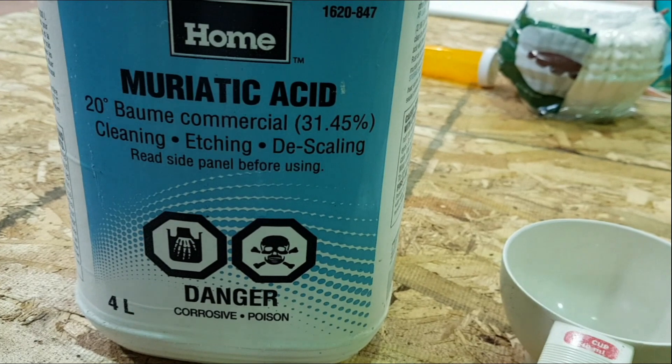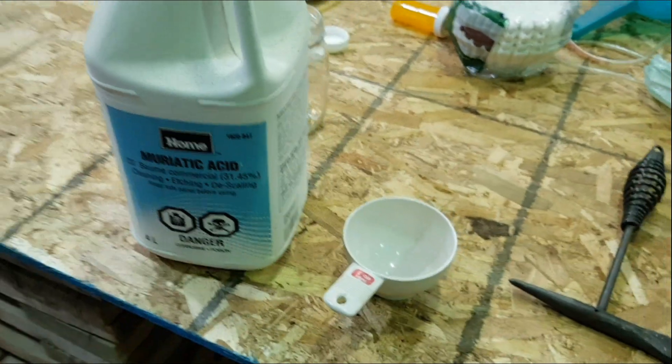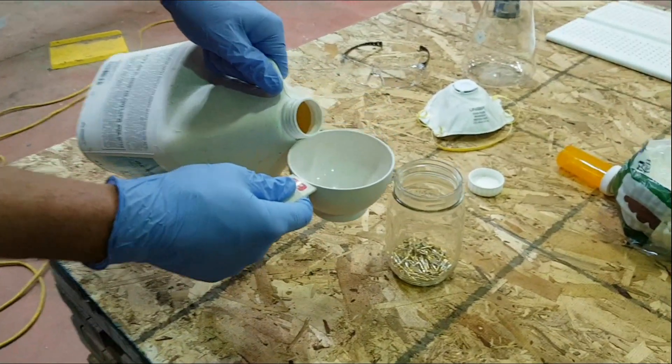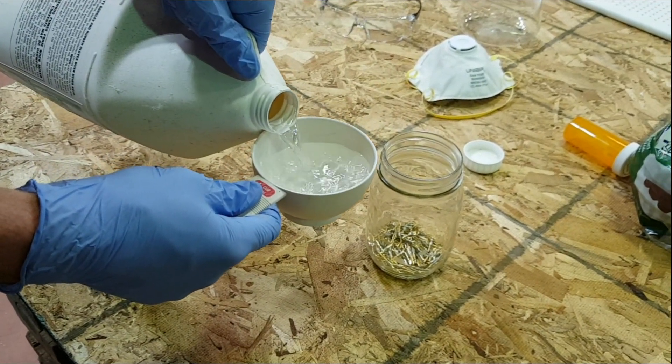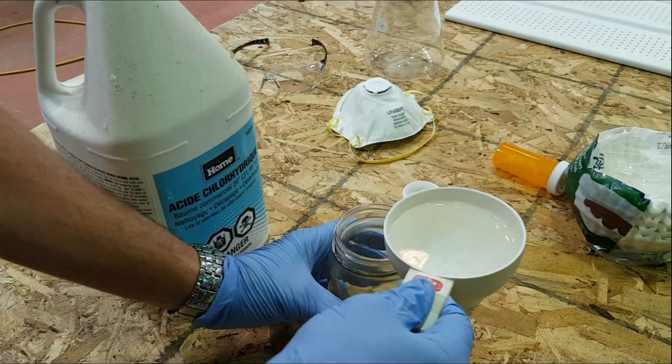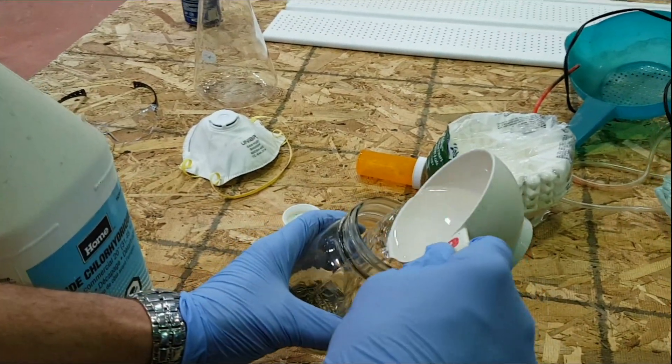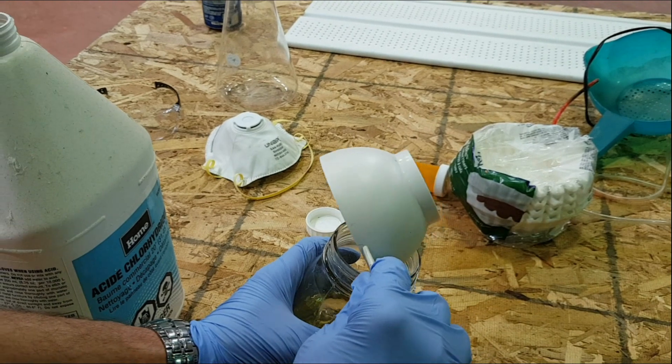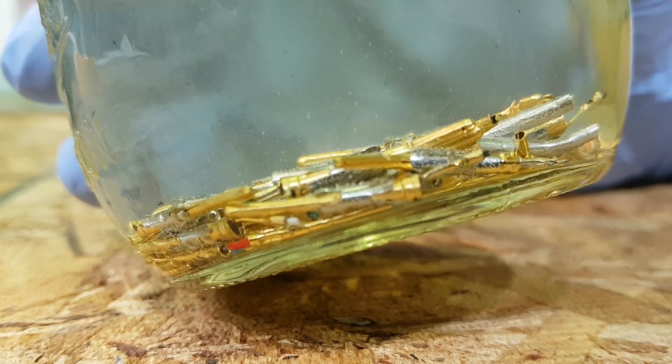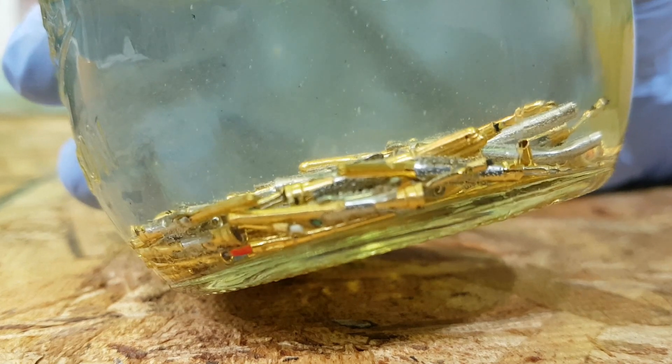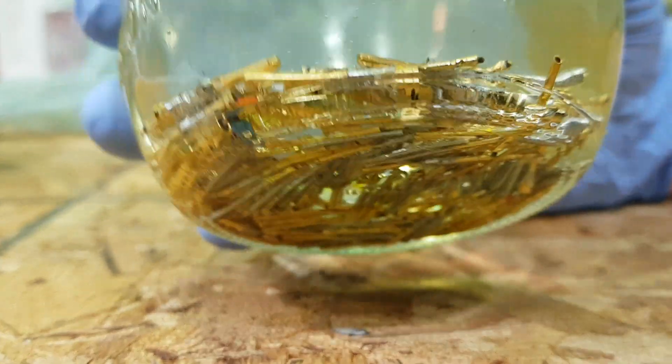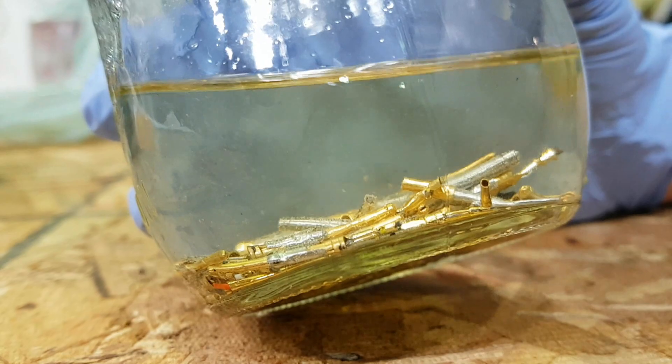So the first thing we're going to add here is muriatic acid. You can buy this at your local hardware store. It's used for cleaning cement and other household uses and it's about 30% hydrochloric acid. Today with this small batch we're just going to add one cup into the mixture carefully. As you can see this chemical reaction is already taking place. The muriatic acid which is 31% hydrochloric acid will eat away at all of the base metals and leave you with just the gold from these pins.